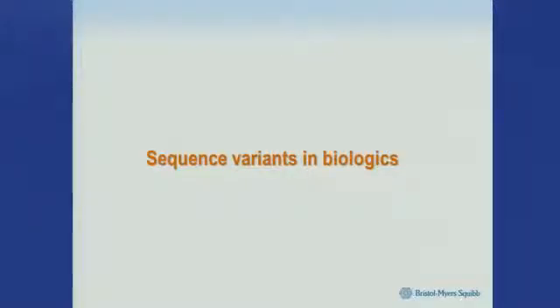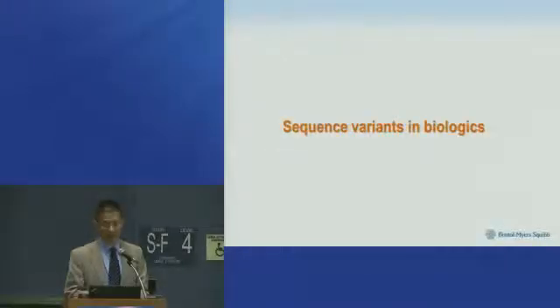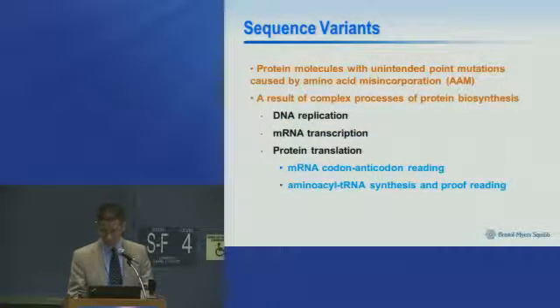For the last part of my talk, I would like to talk about sequence variants in biologics, which is an area that more and more companies pay attention to, and the health authority also realized this is something we may have missed earlier due to the limitation of earlier generation instrumentation.